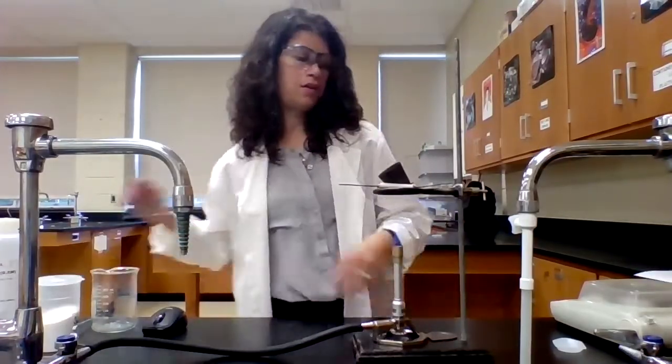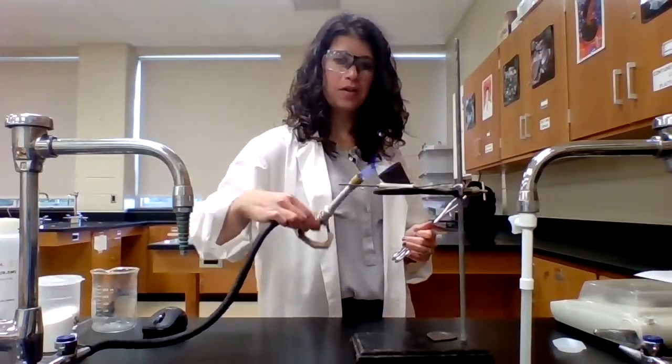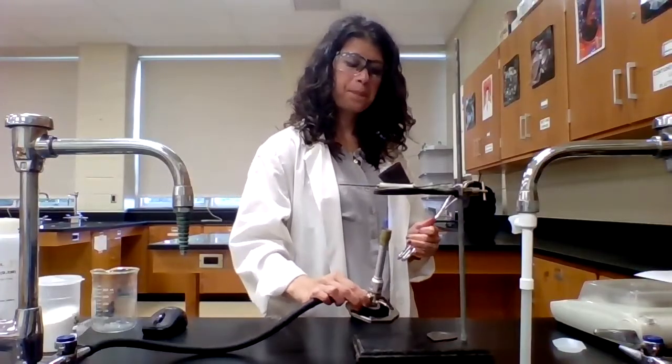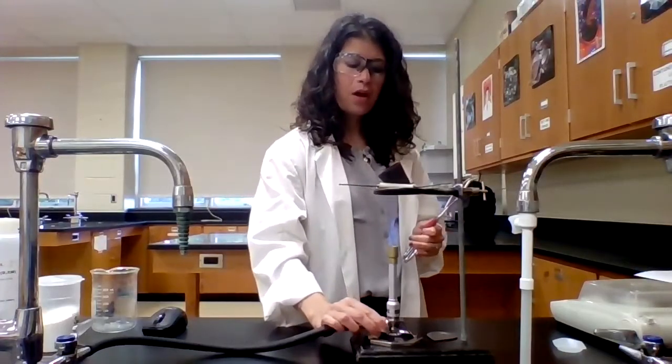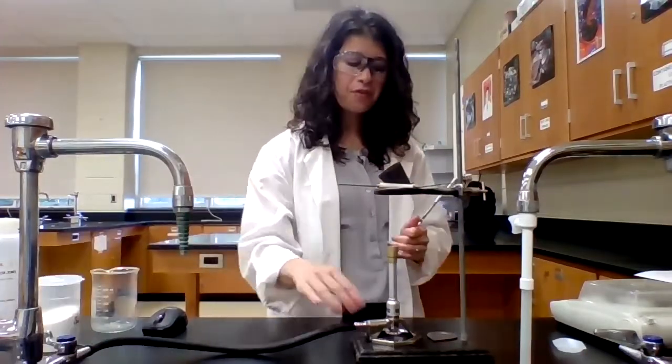So I'm going to let this heat up, and you can even move the Bunsen burner around a little bit and make sure you get all the sides. Okay. So once I've driven off the water, simply turn the gas off.